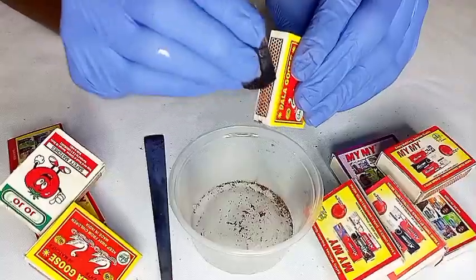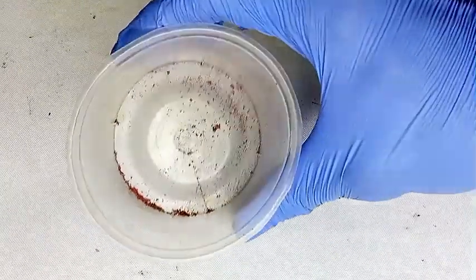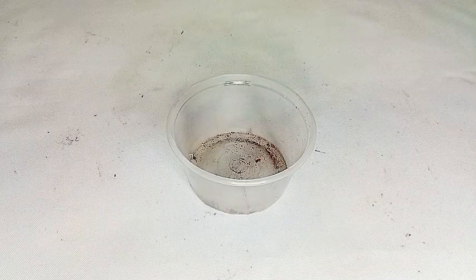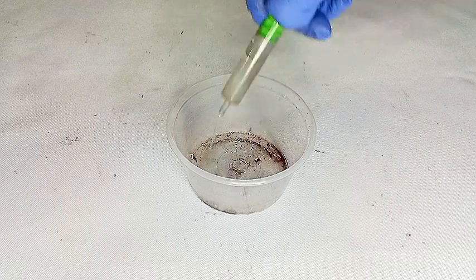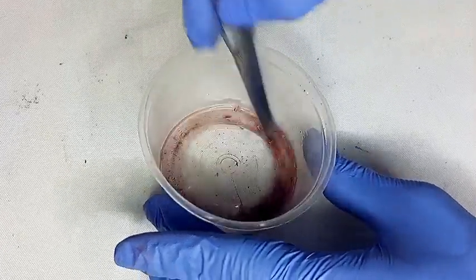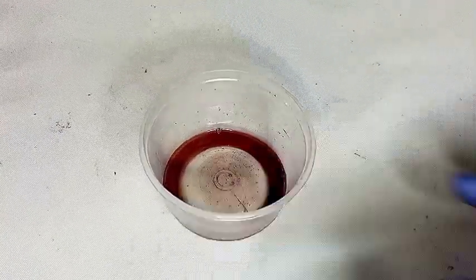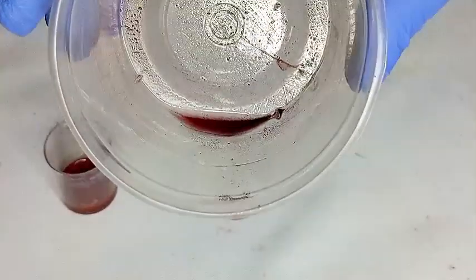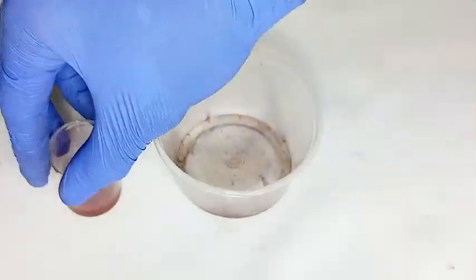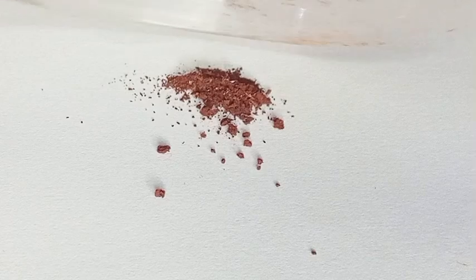After scraping all 10 boxes, we are left with red phosphorus and some contaminants. To wash the glue and cardboard impurities, we soak our mixture with ethanol. Once the washing is done, we decant the cardboard impurities and let the ethanol evaporate. Now we have our significantly purer phosphorus, free of contaminants.